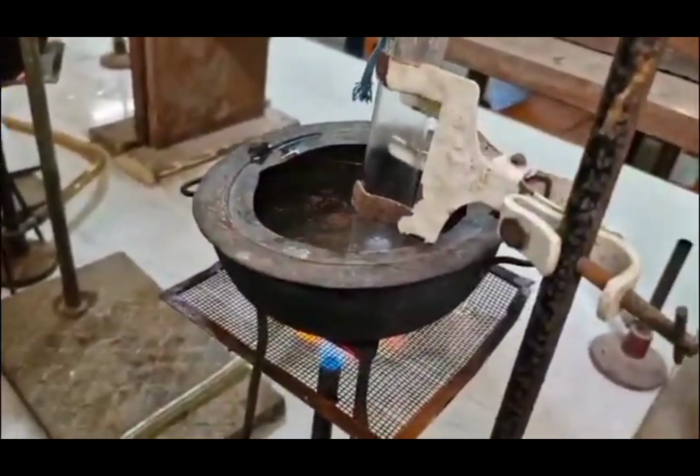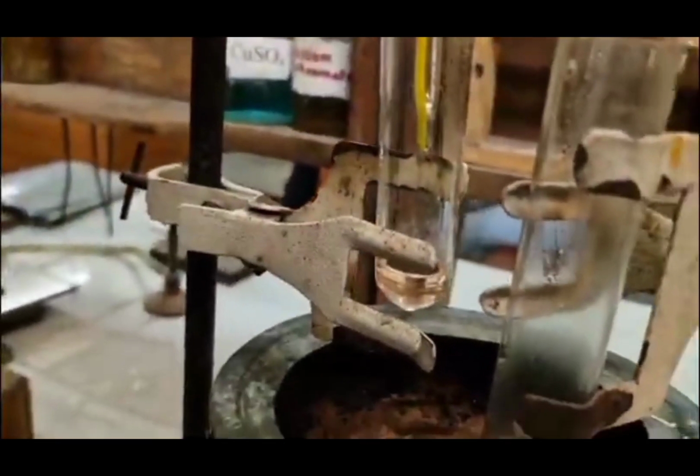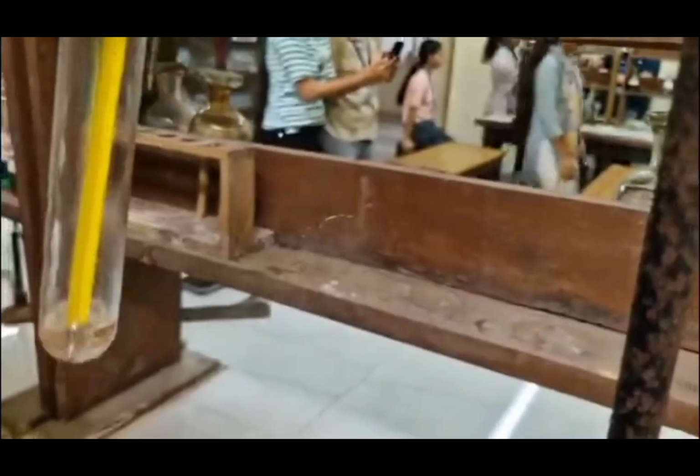We will note down the temperature of both the test tubes when the turbidity disappears. Now in the phenol water system, the turbidity has disappeared. Then we will note down the temperature. Here we can see in the NaCl containing test tube also the turbidity starts disappearing. Then we will note down the temperatures.